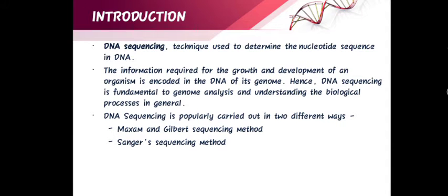So to start with, what is DNA sequencing? DNA sequencing is nothing but the method or a technique which is used to determine the sequence of nucleotides that are present in the DNA. Any information that is required for the growth or the development of an individual or an organism is encoded within the DNA of the particular organism's genome. And therefore, DNA sequencing is fundamental to genome analysis and understanding the biological processes in general.